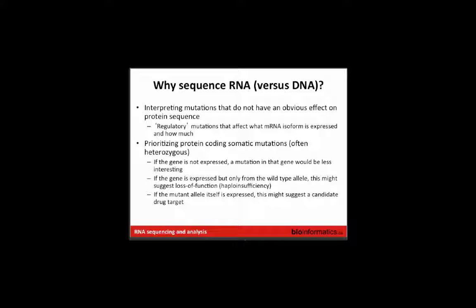Another application that is starting to be more popular is interpreting mutations that don't have an effect on the protein sequence, so looking at regulatory mutations. If you sequence a genome and you see that there are mutations there, and you also sequence the transcriptome, it may help you interpret the functional relevance of mutations in the genome.